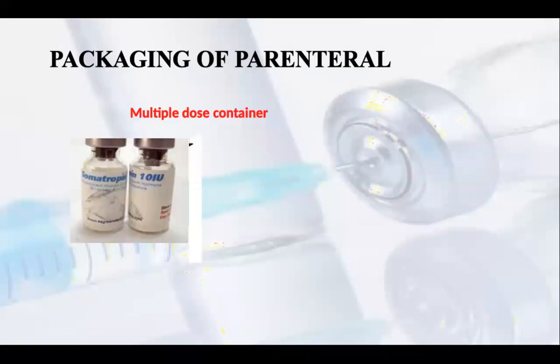For the multi-dose containers, you can see that mostly people who are taking insulin, the insulin is available in vials, and also in pre-filled syringes.